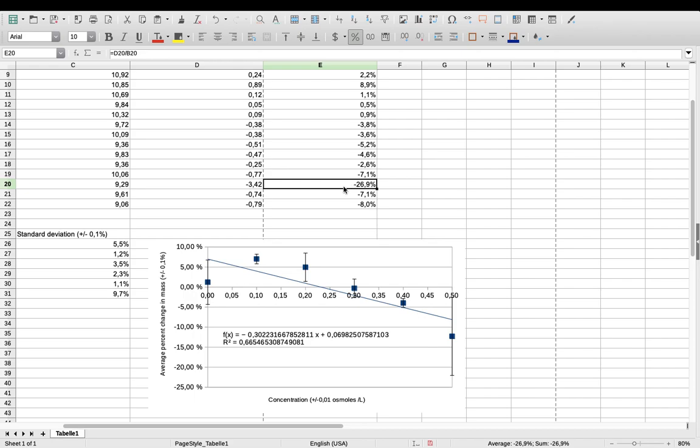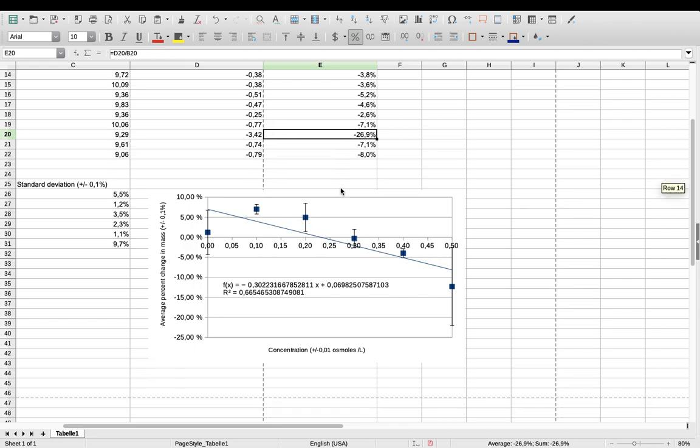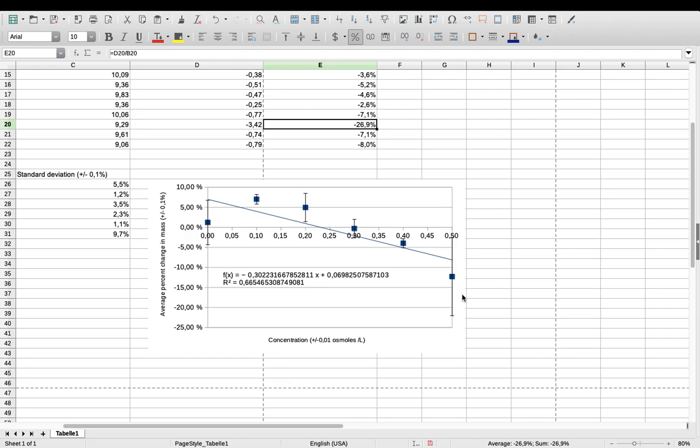So it may be worthwhile, for example, to put this under an asterisk, and therefore it won't be included in this graph, but this data point would be included in the data table that you do publish, so that you're showing your readers, okay, I had this data point, it has an asterisk next to it, and right below the table, the asterisk explains why this data point wasn't included, for example. So if you did that, it would change.